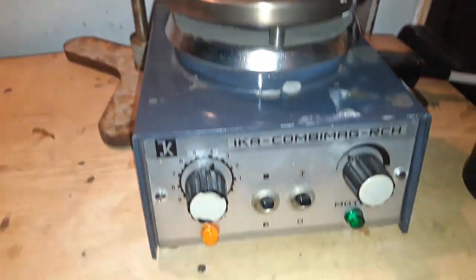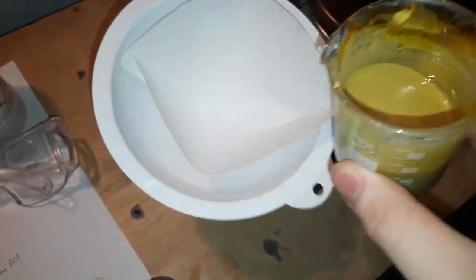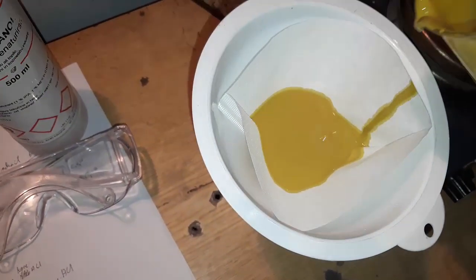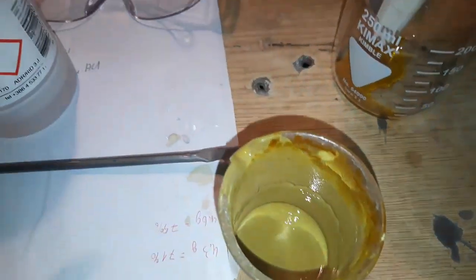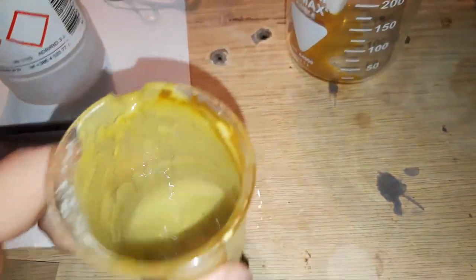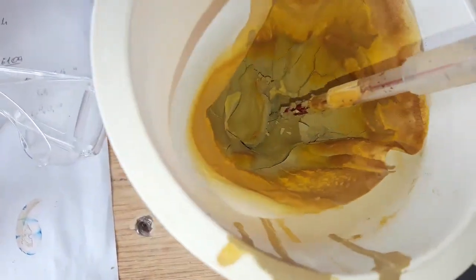We turn off heating and stirring, cool everything down, and filter the solution. We can see it's quite thick and doesn't filter easily. We rinse the beaker with some ethanol and add that to our filtrate. I let it filter and dry overnight. We got a cake of our product that has a distinct green color.